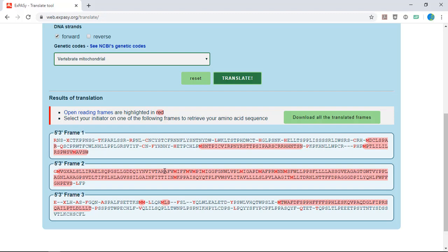If your sequence is poor or contains a lot of ends, you might have more trouble with this. In that case, one thing you can do is compare the translated sequence to the reference human barcode region protein sequence that's provided on Canvas to help you identify which frame is the correct frame.